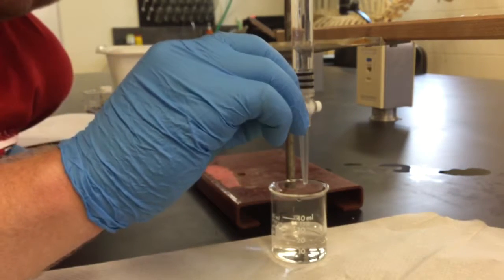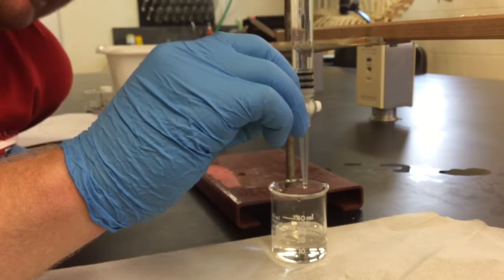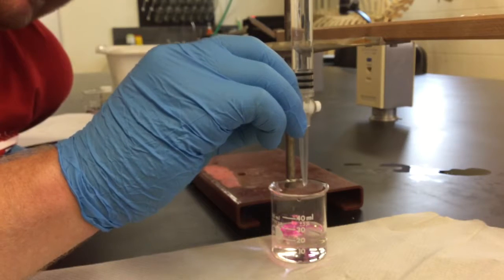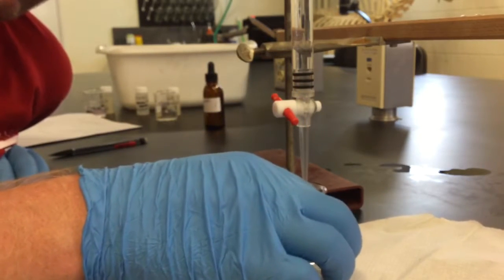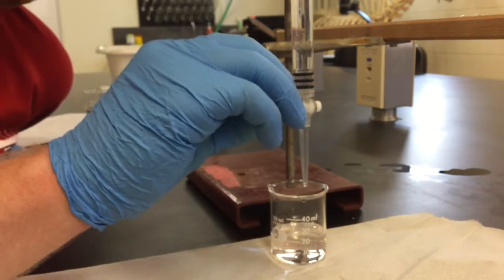Okay, so we're still not there. It's getting close though, because it's taking longer for the pink color to go away as I swirl it.